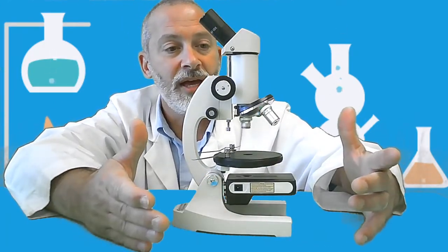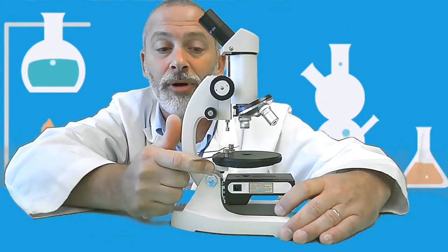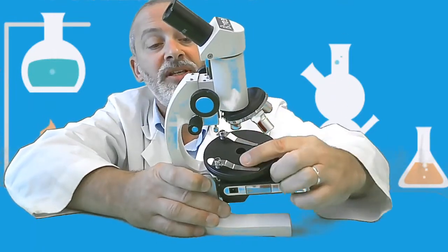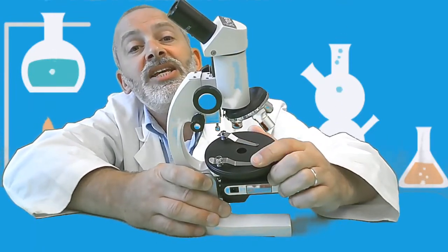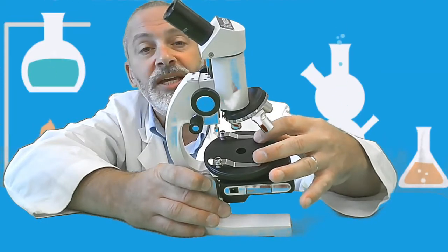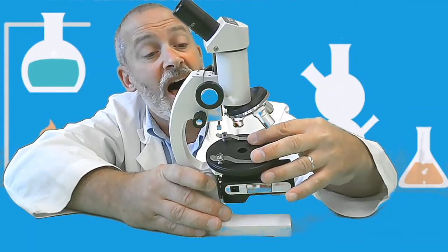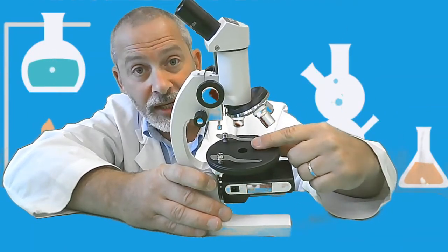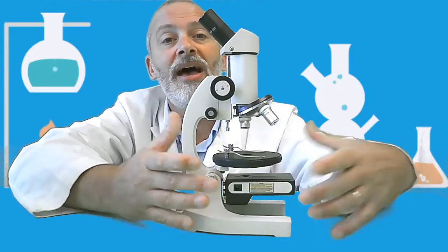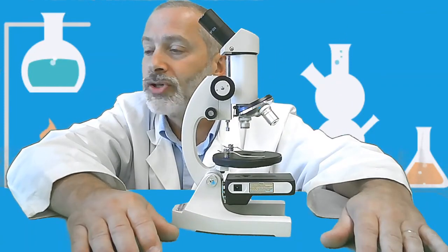I think we mentioned everything else. Correct me if I'm wrong. The only thing that this microscope has that our diagram didn't are these funky things here. These little clips. And these little clips are called stage clips. In fact, if you want to add that to your diagram, go for it. These are stage clips. And stage clips help us to attach our slide, our specimen, to the stage so that it doesn't slide around. So here we have all of the basic parts of our typical compound microscope.